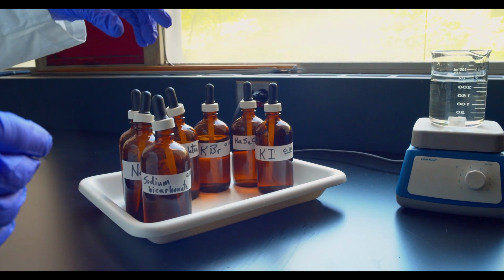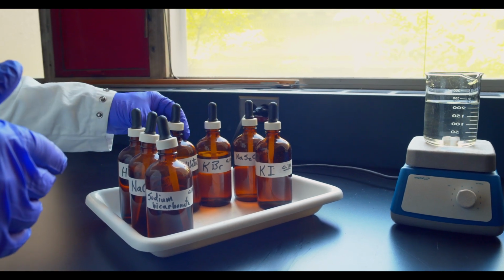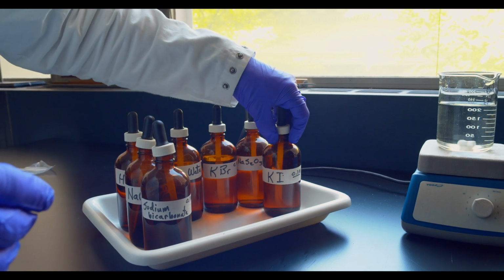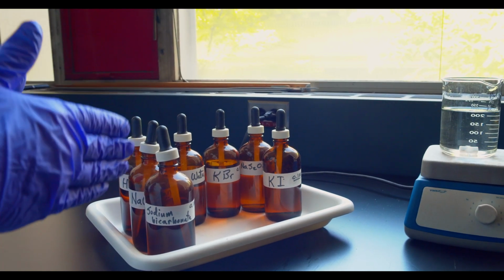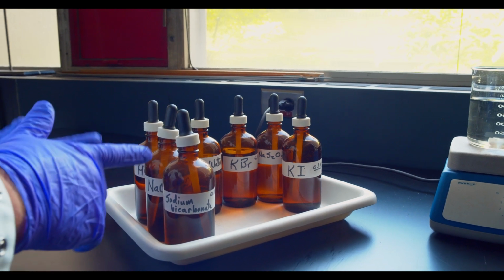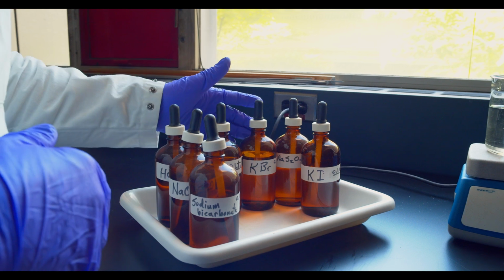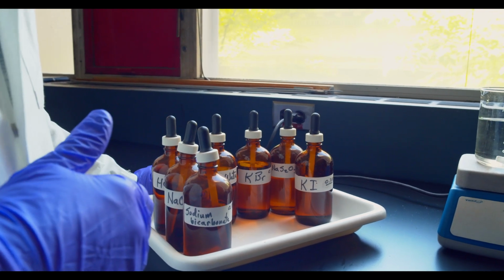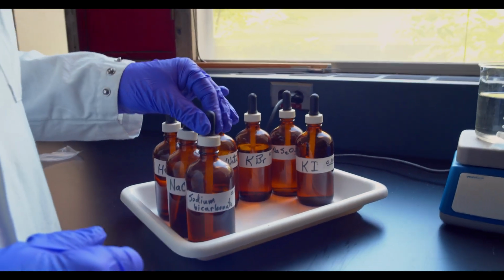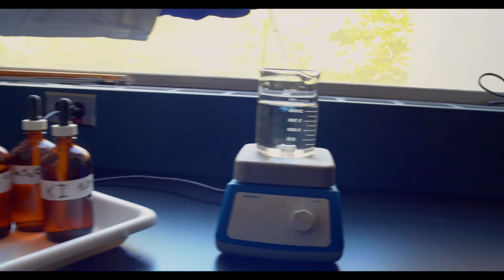We will start with sodium bicarbonate, go to sodium hydroxide, hydrochloric acid, ammonia, potassium bromide, sodium thiosulfate, and potassium iodide. So we're going to form complexes and precipitates. The complexes will be soluble, and the precipitates are ionic compounds of silver that are insoluble. Let us start with the sodium bicarbonate, and we expect to form a silver carbonate.